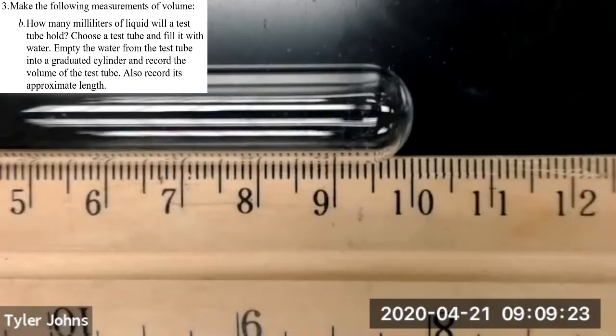So after transferring the water and determining the amount of volume that fits in our test tube, we also need to determine the length of that test tube that we used. So this is the length of that test tube.